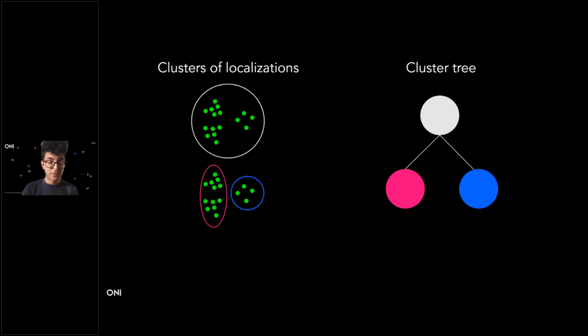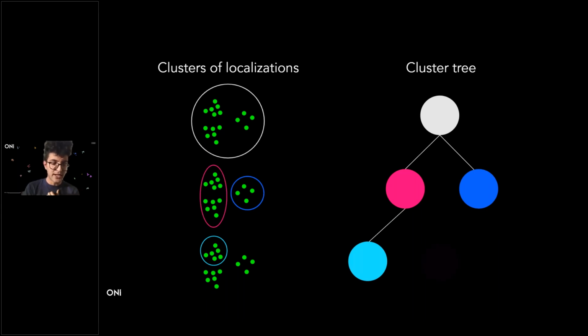As many of you said, there do appear to be 3 clusters if you look at it in a certain way. So what we can do is break down that pink or magenta cluster on the left into this cyan and this purple. Now, even if we do that, we may not actually want to break down the blue cluster on the right-hand side. So we might want to kind of retain that. And what we're saying there is that blue cluster is already of some kind of minimum size of a cluster and doesn't really benefit in terms of the analysis from breaking down even more. And using different types of metrics, the algorithm actually is able to decide when a cluster doesn't need to break down any further. Maybe it's reached some kind of limit. And you can see here the blue does not have any further children in the cluster tree.